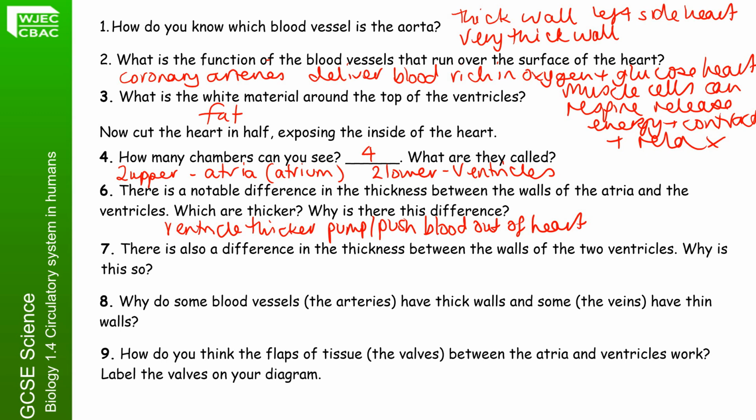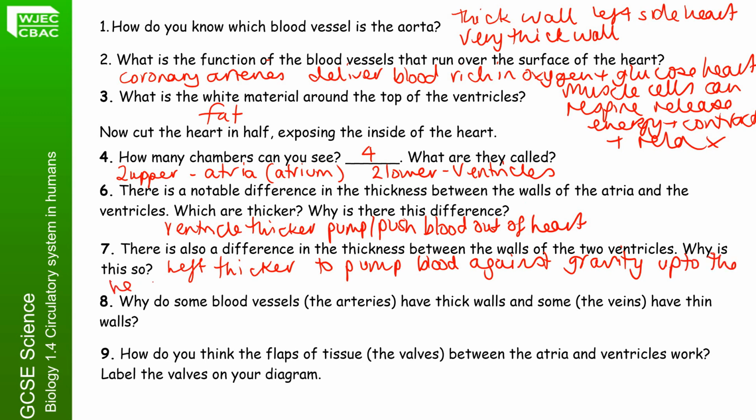There's also a difference in the thickness between the walls of the two ventricles, left and right. Why is this so? So the left is thicker to pump blood against gravity up to the head and down to the arms and legs, and the feet and the toes.